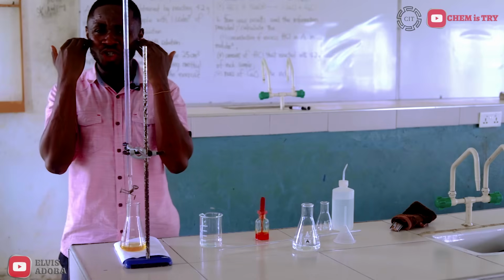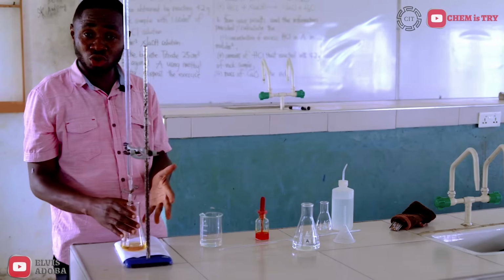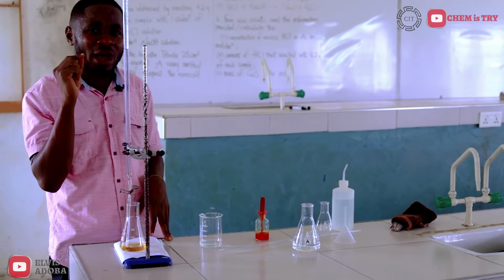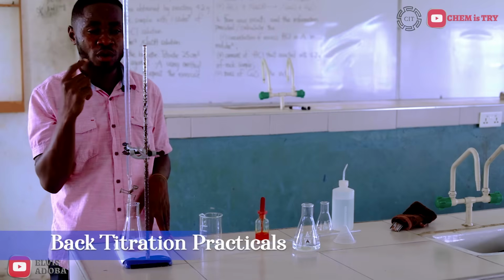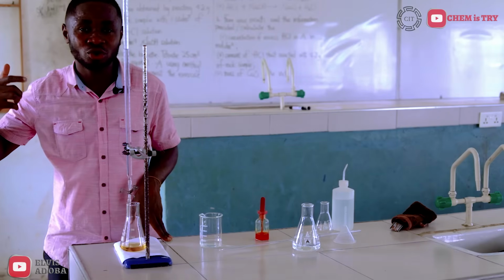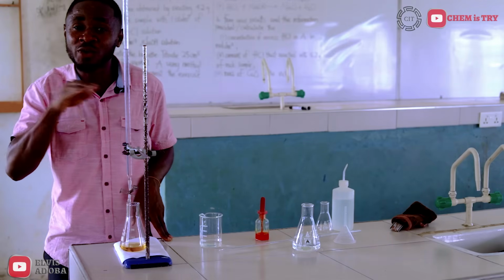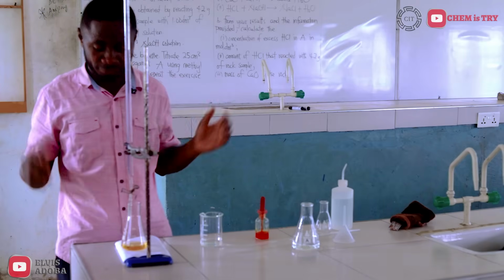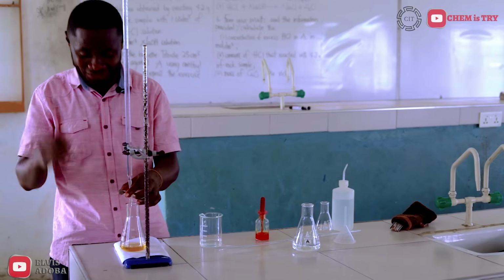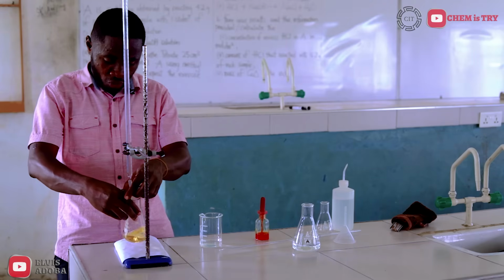If you use your own intuition to determine where you're going to release up to, and you release and you swirl, and you realize that the color has already changed, it means that the actual endpoint is even below where you released up to. So use your intuition once again to do the titration all over again, but this time, reduce where you release up to. That's it. So mine, fortunately, the color didn't change. That means I've still not gotten to the end point. So my intuition was right. A drop, then I swirl.